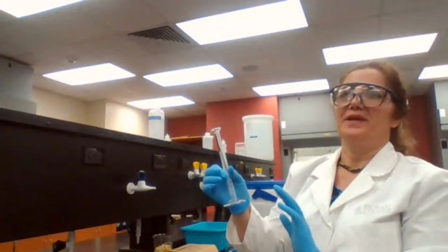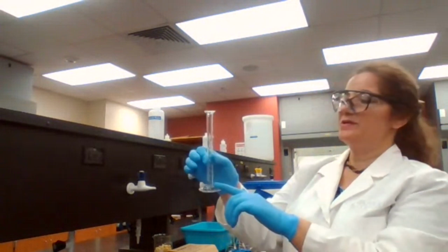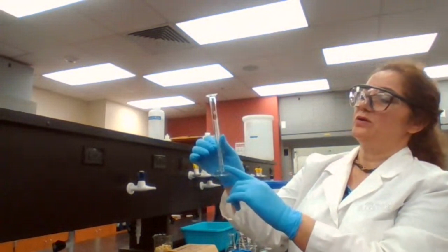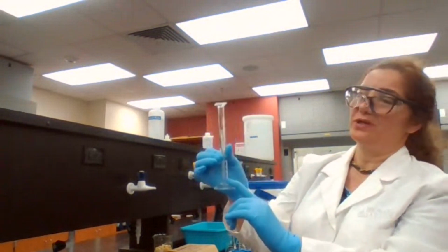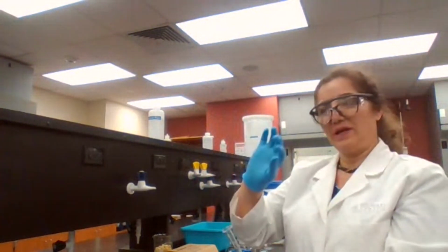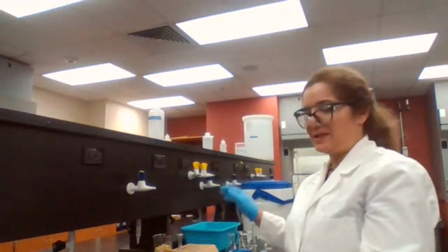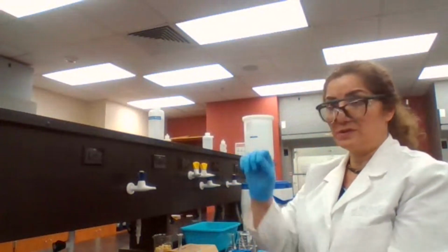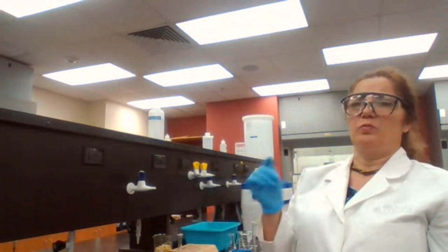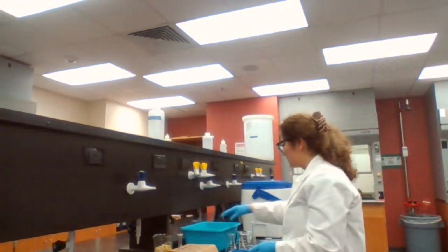If I use the dropper, I get a more accurate measurement than using 0.4 milliliters in a graduated cylinder, because the first milliliter is not graduated, and unless I have an automatic pipettor or a very accurate pipette set up for me, I prefer to count the drops. So I only counted 8 drops for 0.4 milliliters, if you want to write that in your procedure.